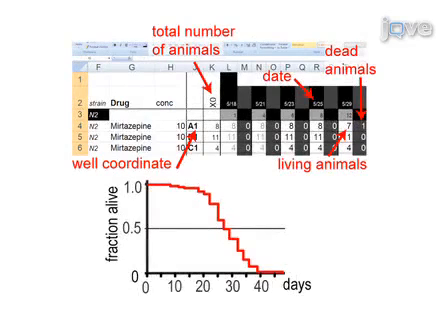From this point forward, the number of living and dead worms is determined every 2 to 3 days until all worms have died. Observation is done using an inverted microscope, and the number of dead and live worms is recorded in each session.